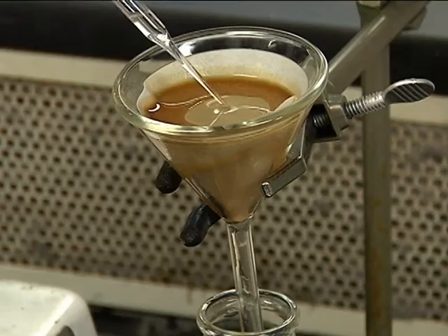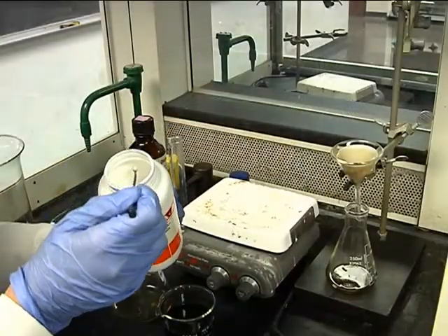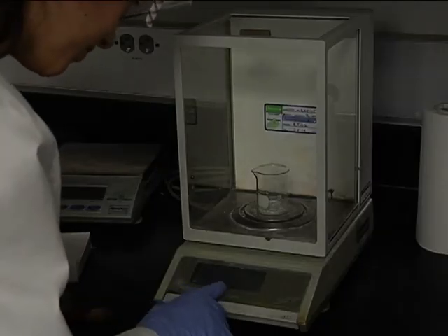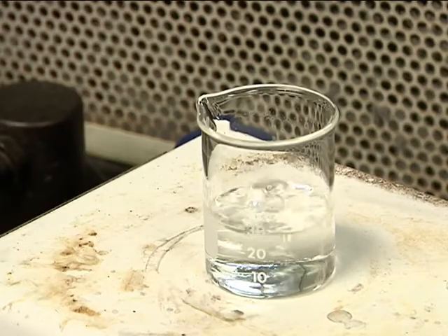Next, we transfer the methylene chloride to a beaker and add sodium sulfate to absorb any leftover water. It leaves little crystals at the bottom of the beaker. We take a new beaker and weigh it — we'll use that number for the calculation at the end of the experiment. Then we transfer the methylene chloride into the beaker and put it on a hot plate until the chemical evaporates.